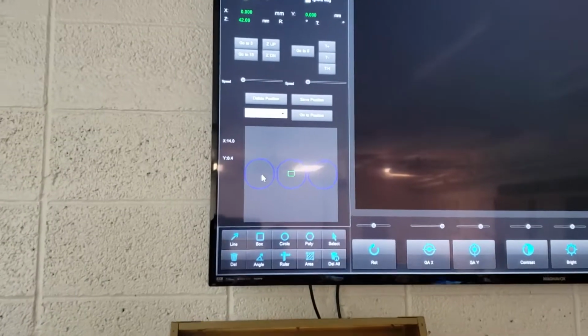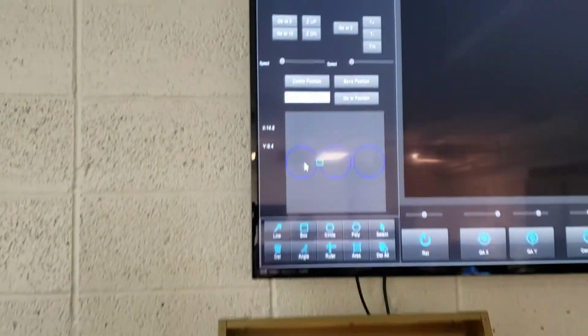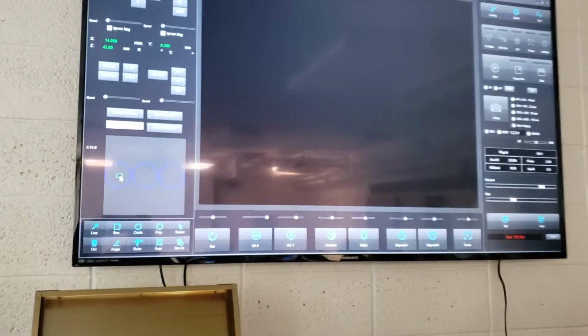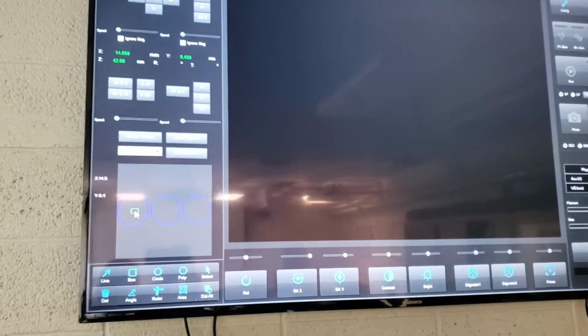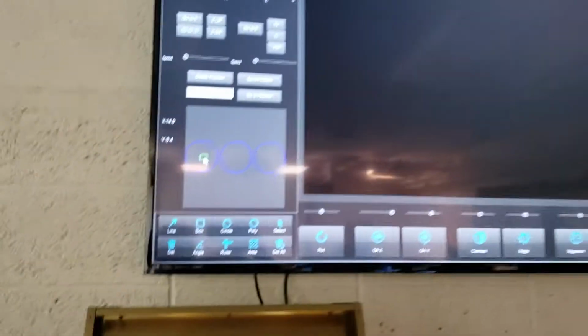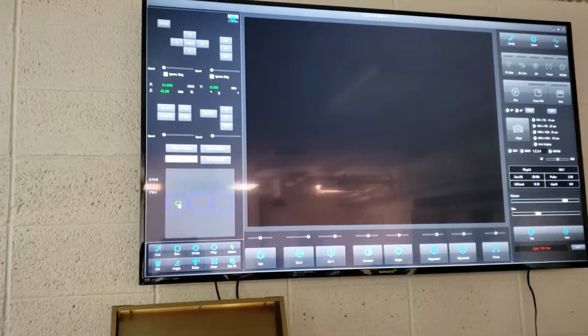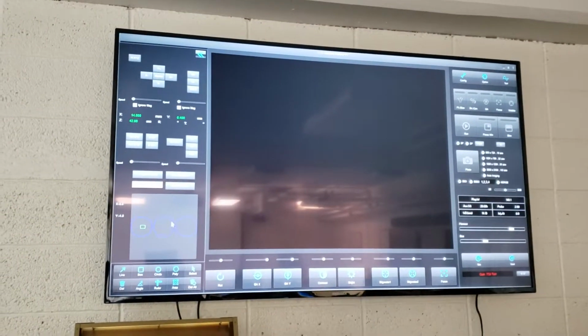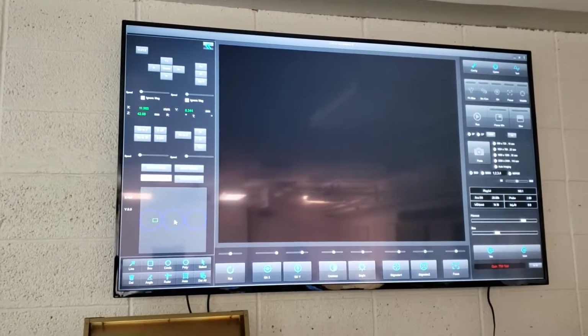It moved out. So that means this sample right here is the closest one, the one closest to the door, which makes sense. The closest to the door is the left. 1, 2, 3. Right, and then if I double click here, it'll run to that sample.